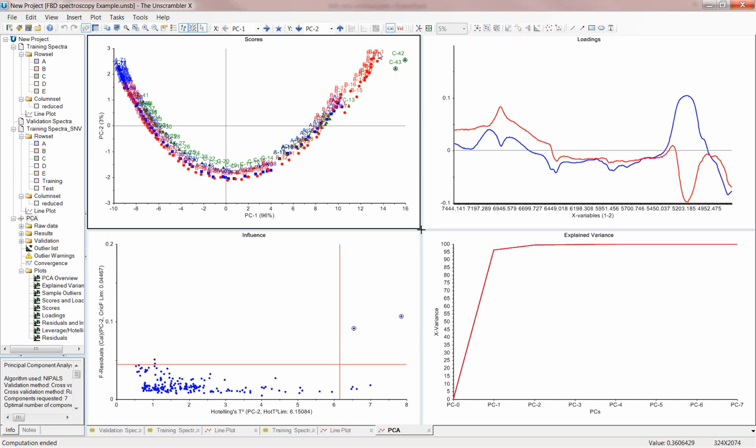Okay, so in this case, we can see that this tends to be the beginning of our drying. So this is all A1, A2, C13s or so, B1s and 2s. So these are early in the samples, towards the end of the samples, or the drying time. And these are later samples for C. So it could be that these particular data points, maybe they were collecting even after they stopped the drying. There could be something going on there.